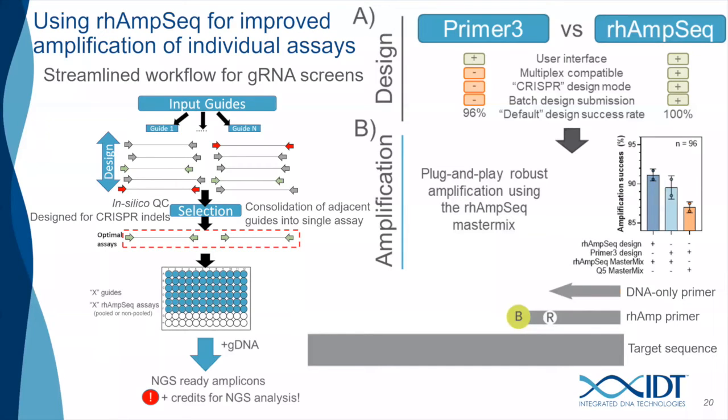And just to highlight what the different primer structures are that we're looking at here, since these are just single amplifications, that RNA base and that blocking group really is there for the multiplex capability, but works just as well in singleplex as a DNA only primer here, but just highlighting what the differences are of those different types of structures of primers and how that activity compares.